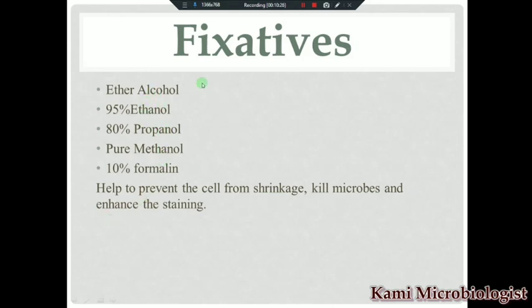Now, what are the purpose and principle of this fixative solution? It is important to prevent the cell from shrinkage. It will kill the microbes. Moreover, it can enhance the staining. That's why it's really important.